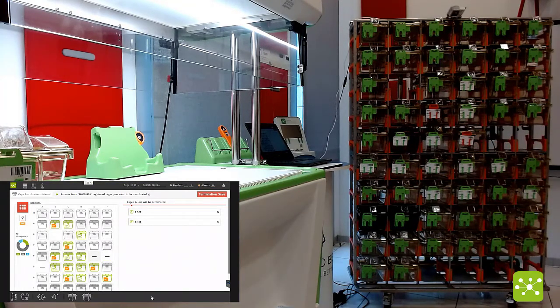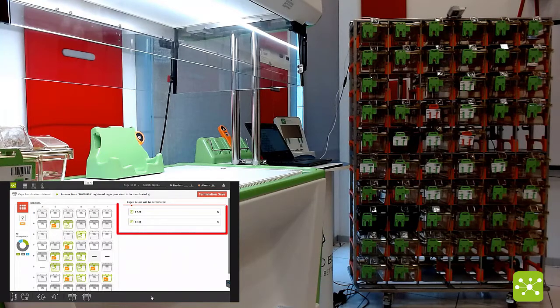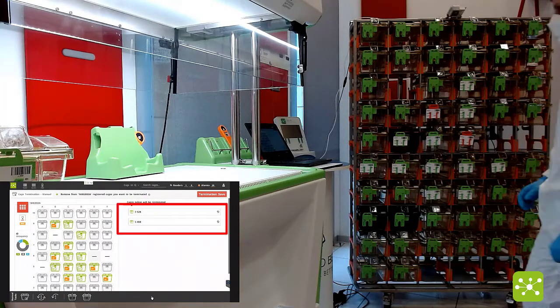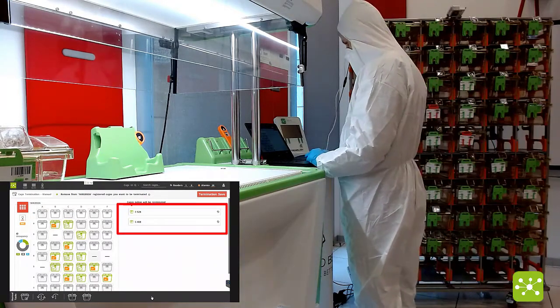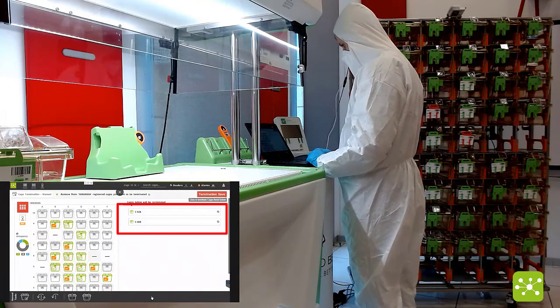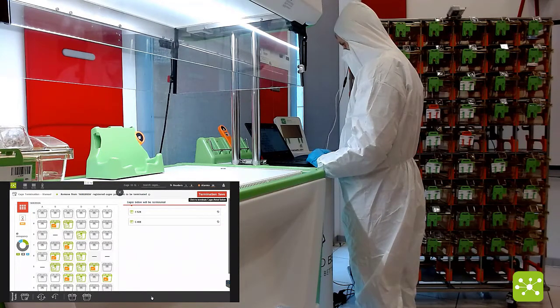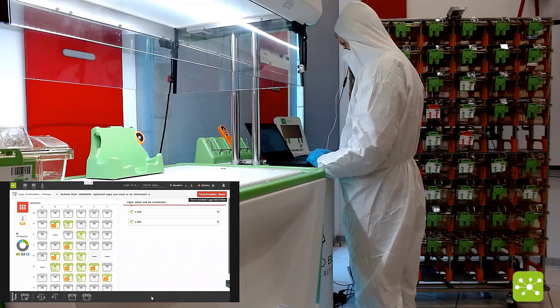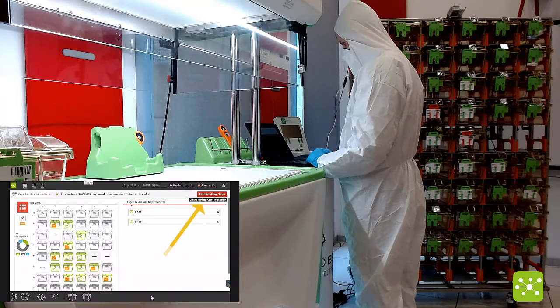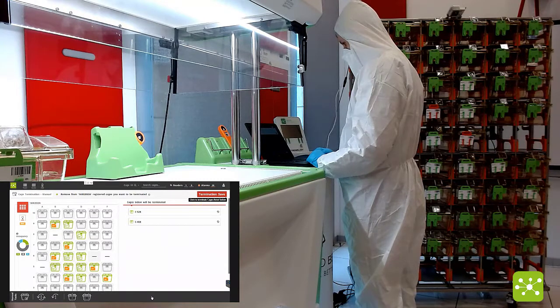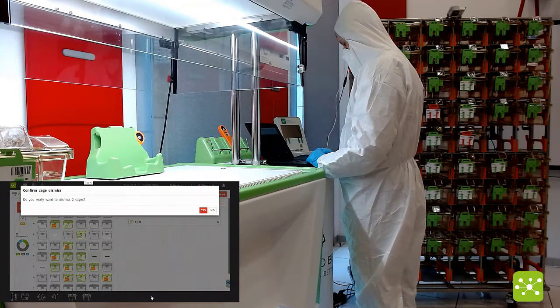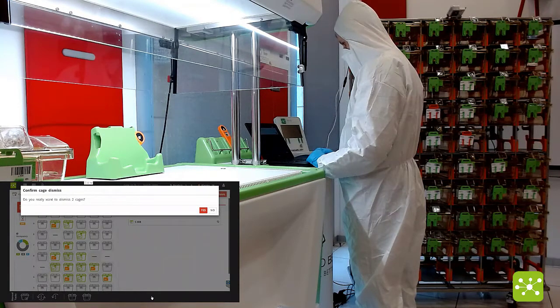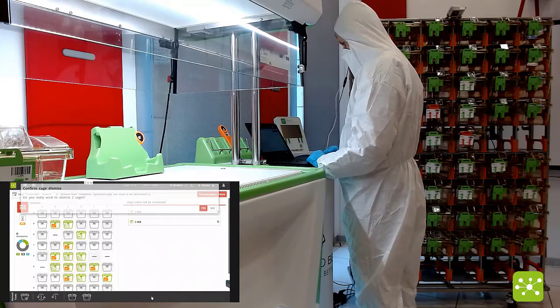When you extract these cages, the corresponding cage IDs appear on the right side of the screen. If you want to confirm, you have to click on the corresponding button and the system is double checking if you want to proceed.